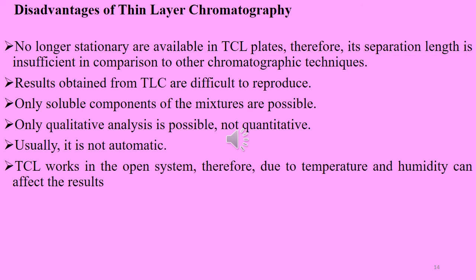It is usually not automatic. TLC works in an open system, therefore temperature and humidity can also affect the result.